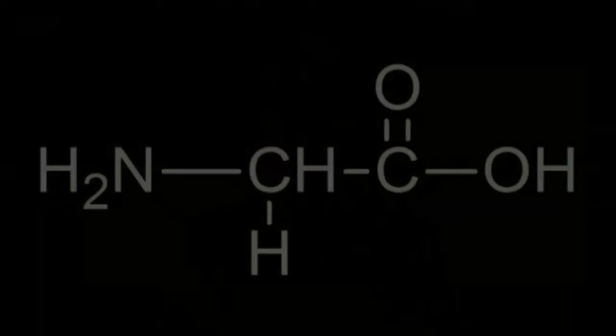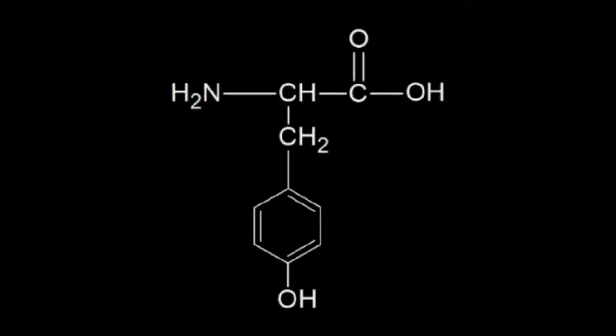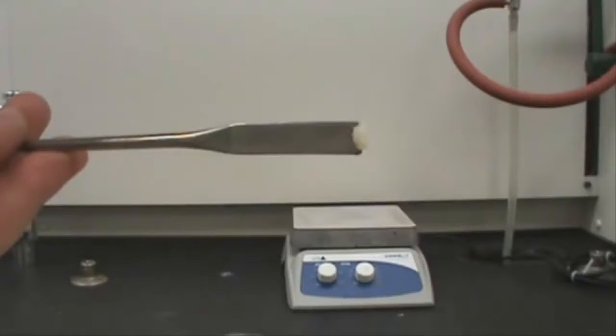Part 2 of this lab tests for different characteristics of your casein using the Ninhydrin Test, Biuret Test, and Xanthoproteic Test. In all three tests, you will be testing your casein against glycine, a nonpolar amino acid, tyrosine, a neutral polar amino acid, and egg albumin, a protein commonly called egg white. In all three parts, you will only need a small amount of the casein as shown.